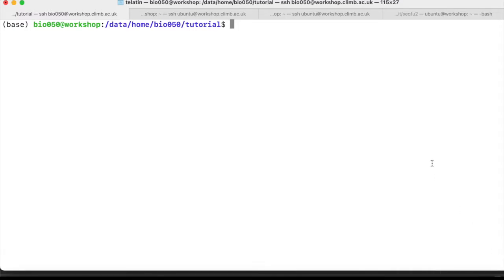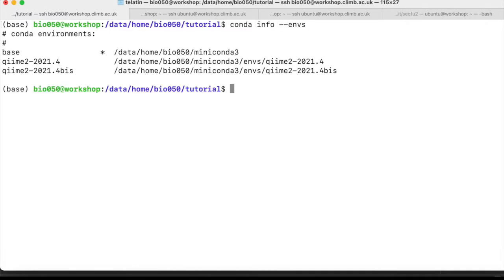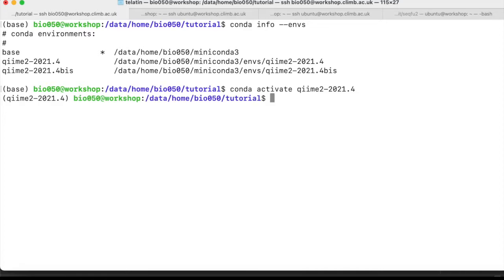So we can activate our environment. If we forgot how our environment is called, we can simply list the environment with conda info --envs, and then we can activate with conda activate qiime2-2021.4. Okay, we have QIIME now.